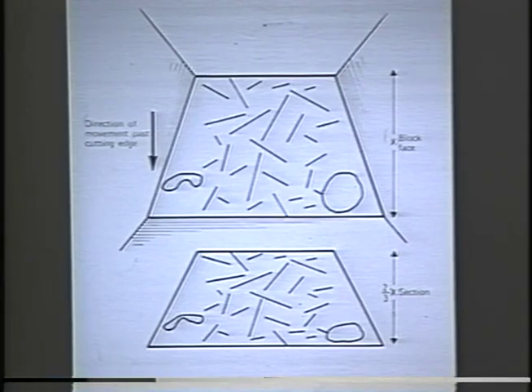Another thing that you can do after you've cut the section is to spread the section. In the past, people used things like trichloroethylene or xylene or other terribly toxic chemicals. And this is something we try not to do today. We use a heat pen now, and they're commonly available, and they seem to work quite well.